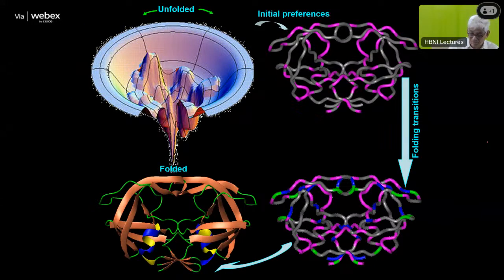Okay. So finally, this is the finally folded state, the native state. And all of this is shown on the native state to show that there is a cooperativity, how it induces the structure in the neighboring ones, eventually to reach this state. So that is how the folding pathway can be identified.